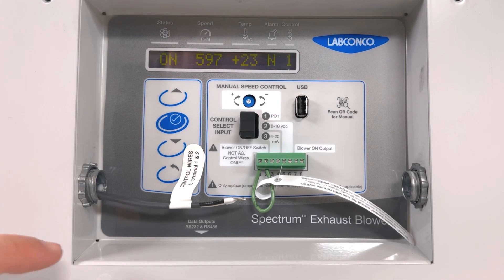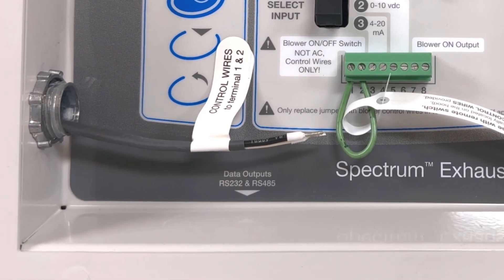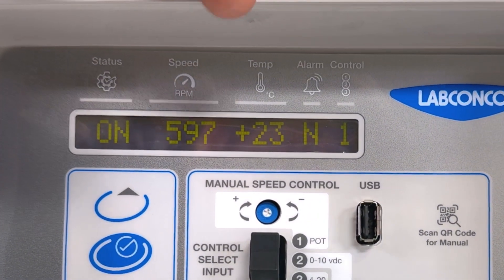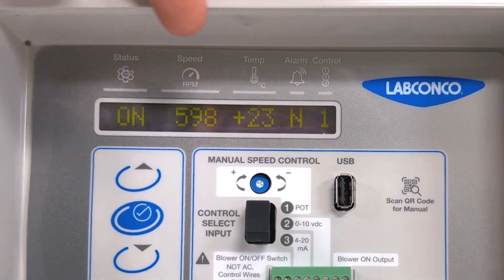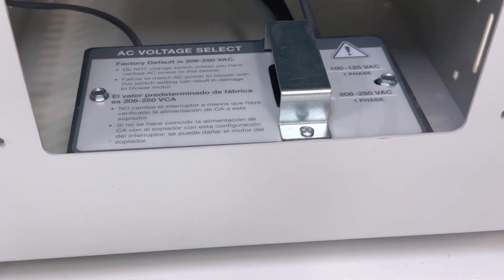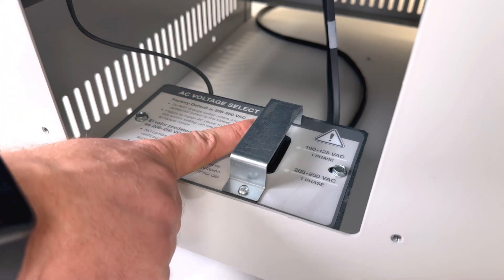Data from the blower can also be output to a building management system via RS232 or RS485 ports. The digital readout depicts various blower status indicators such as RPM and various alarms to help troubleshoot errors. One horsepower models come conveniently prepared to operate on either 115 volt or 230 volt systems with the simple flip of a switch.